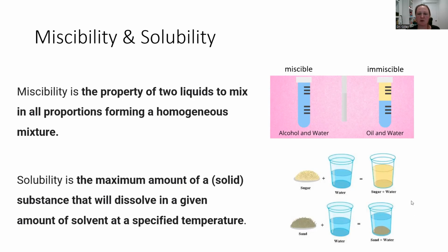So for example, if you had mixed some sort of alcohol like ethanol or isopropanol with water, right, those two liquids are miscible, so they will just form one homogeneous layer. If you mix oil and water, those two liquids are immiscible, so they will form distinct layers. And because water is more dense, it will sink to the bottom, right? And that's the blue layer here.